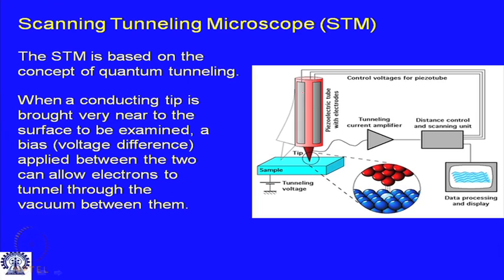It is also important, from the standpoint of using an AFM, that you understand the basic physics, because that will really help you to enhance the resolution or quality of your image to a large extent. Okay, so this is how we will proceed.